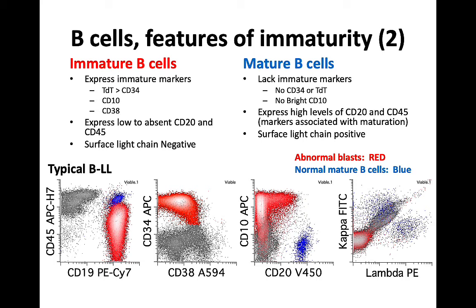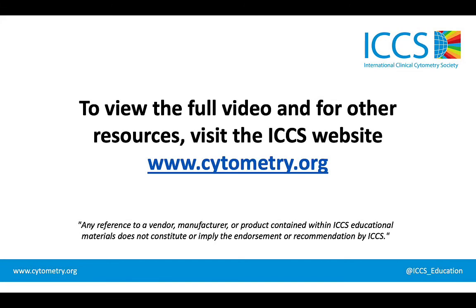Looking at kappa versus lambda, our abnormal B-lymphoid blasts are negative for both kappa and lambda, but the normal background mature B-cells in blue show polytypic expression of these two light chains. CD38 can be increased in an immature B-cell population, but here the level of CD38 is relatively low — that decreased CD38 expression really distinguishes this abnormal blast population from a normal B-cell precursor. That's part of our secondary steps, and we'll talk more about those tools in video two.